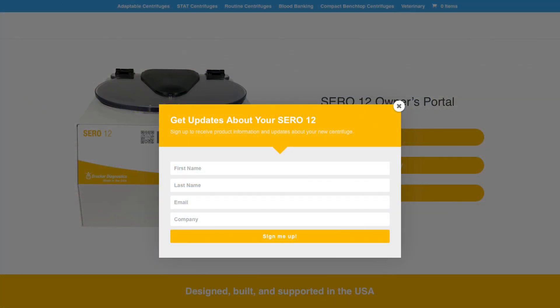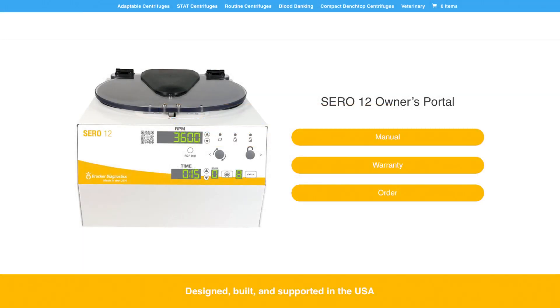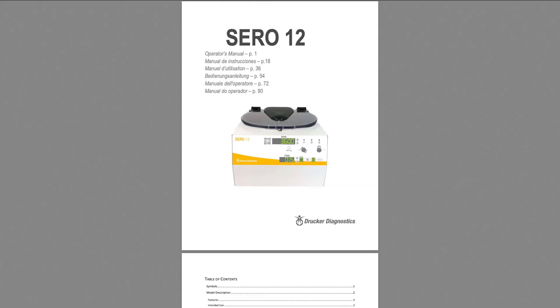You will automatically be redirected to the owner's portal. You'll first see an invitation to register your new centrifuge. We recommend registration so you receive important updates about the SERO 12. Once you've registered, you'll see a page with several different options useful to you as the owner of a SERO 12 centrifuge. Click on Manual to instantly access the PDF manual for your SERO 12.